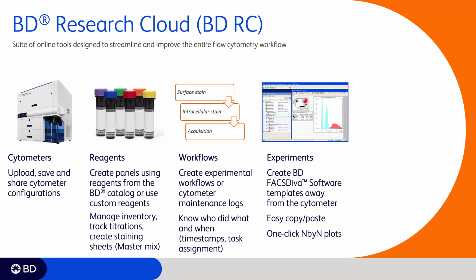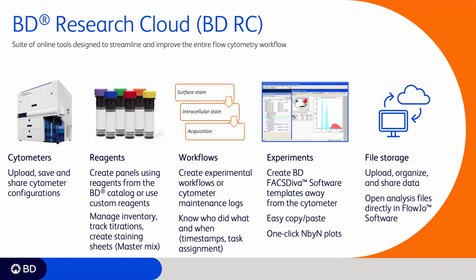And lastly, there's a file storage component where you can upload, organize, and share your data directly in BD Research Cloud. This has connectivity with FlowJo built in, no plugins necessary, so that you can perform your analysis in FlowJo from any computer.